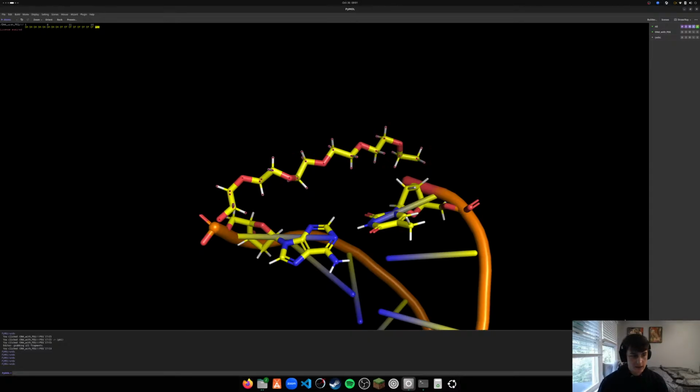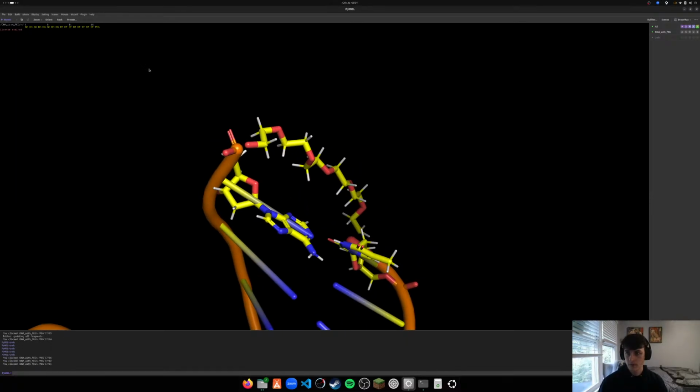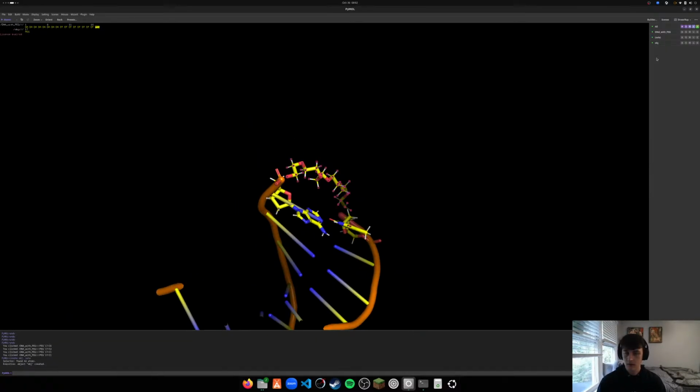Maybe I select it like that. Come on. Oh, I need to create object probably. And then remove atoms.